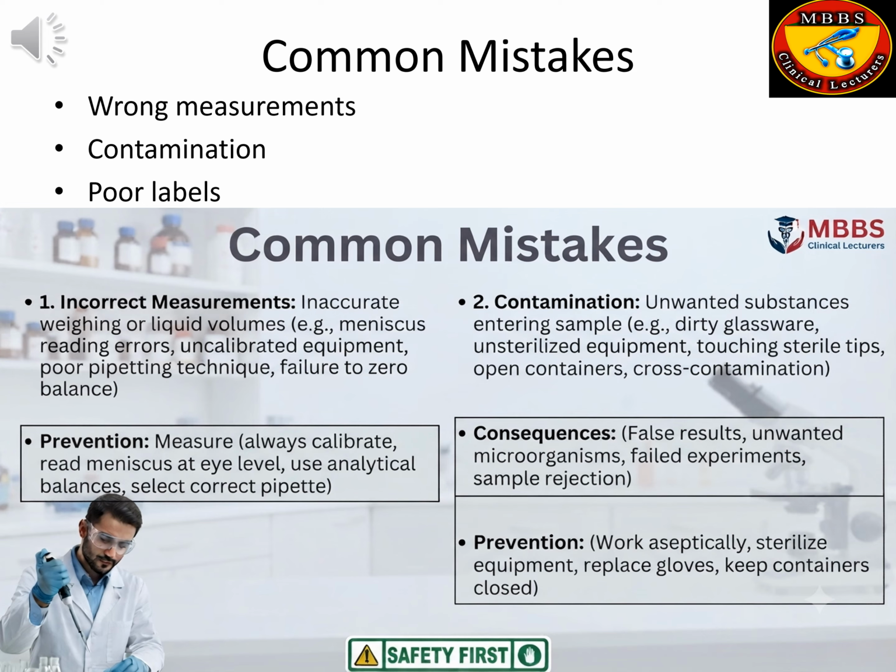Safety hazards. 4. Failure to follow SOPs. Ignoring laboratory protocols can result in experimental failure, safety incidents, poor reproducibility, invalid data. Every procedure should follow the approved SOP exactly. 5.